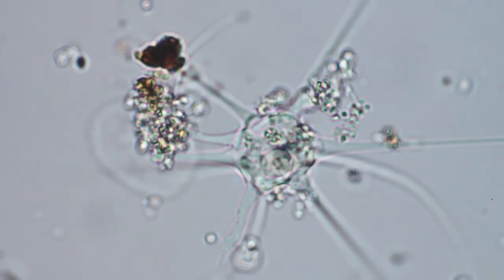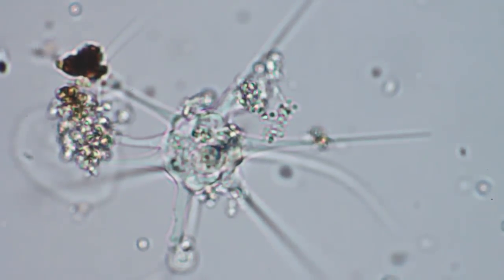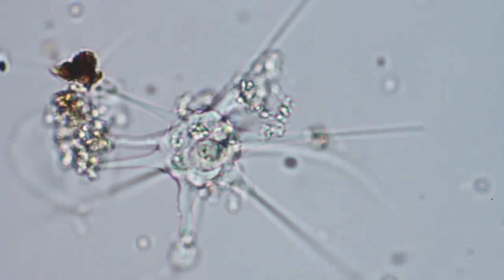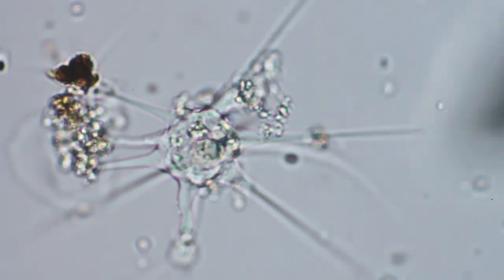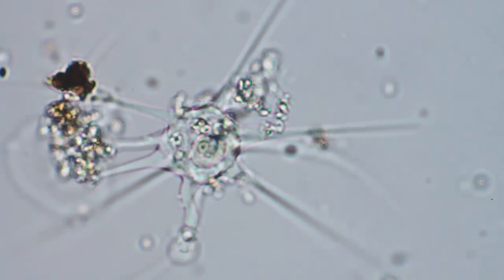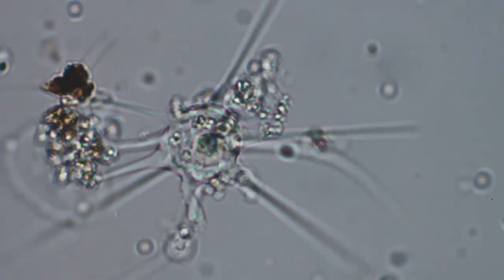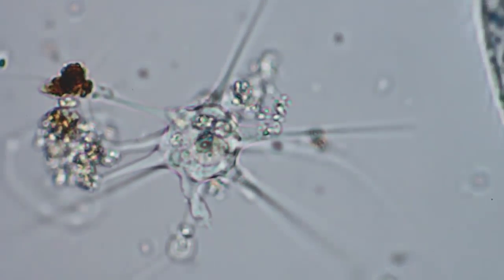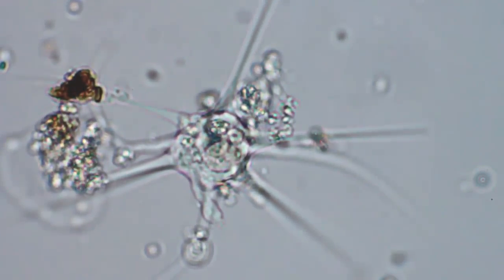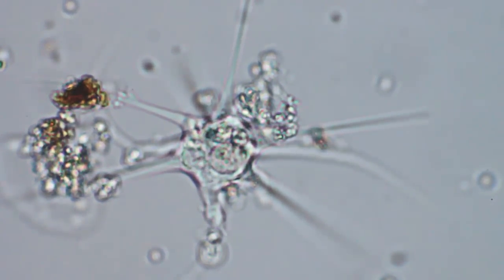It doesn't take much. Let's adjust the iris here and adjust this field diaphragm a little bit. I'm still not used to the terminology here.